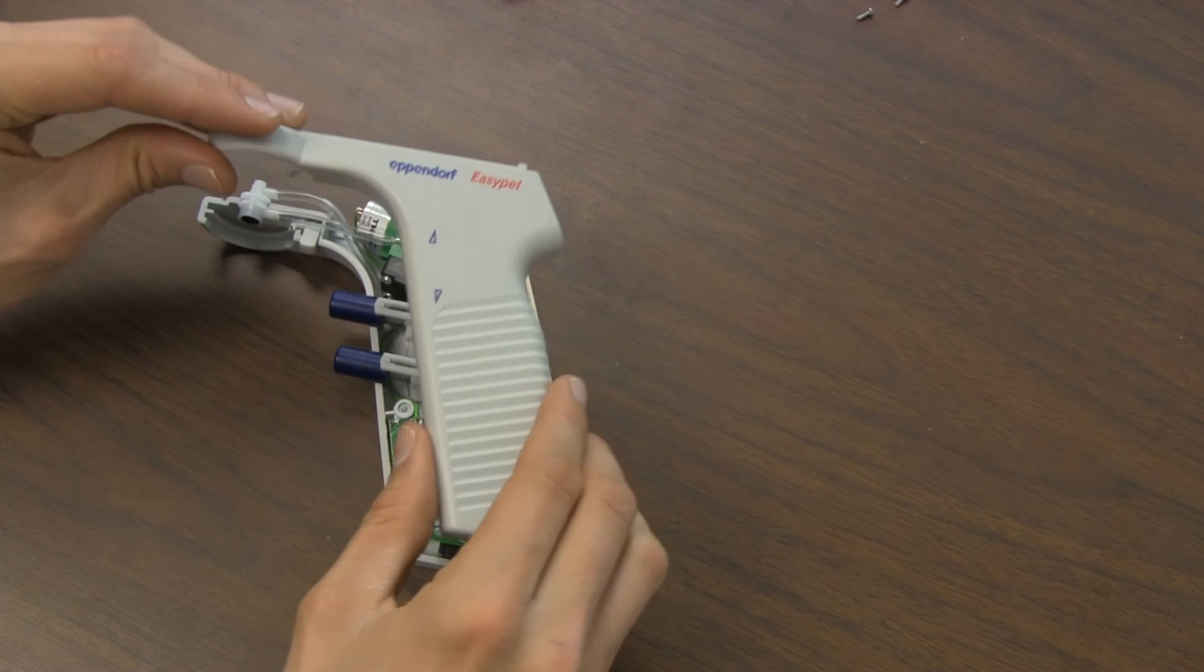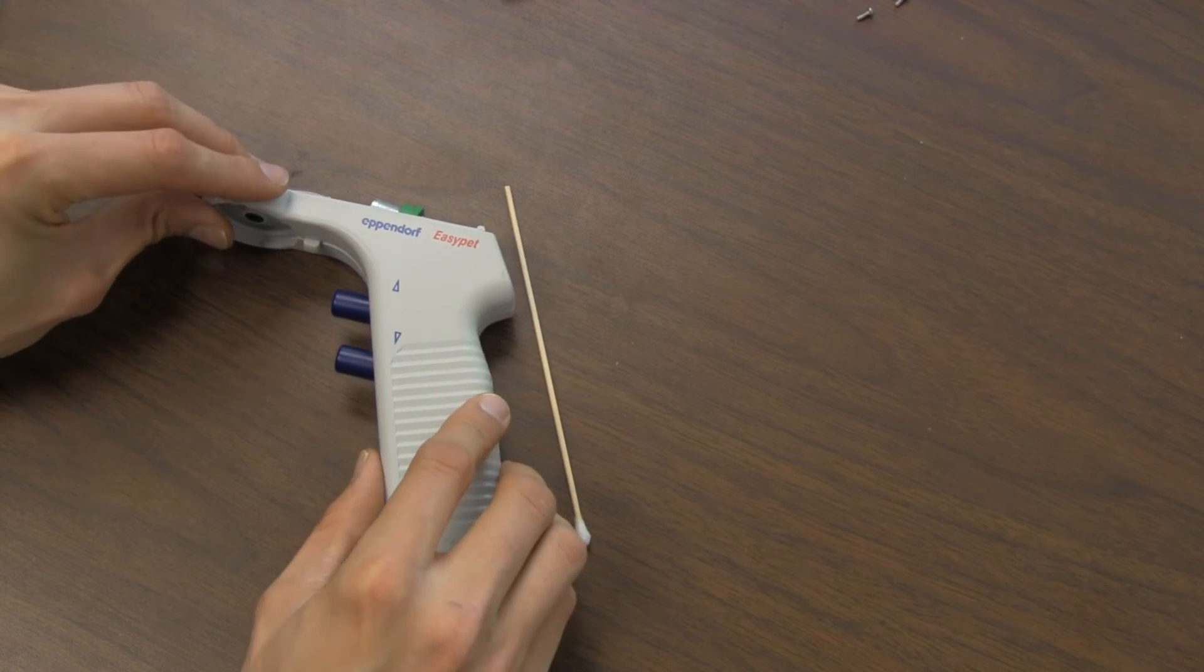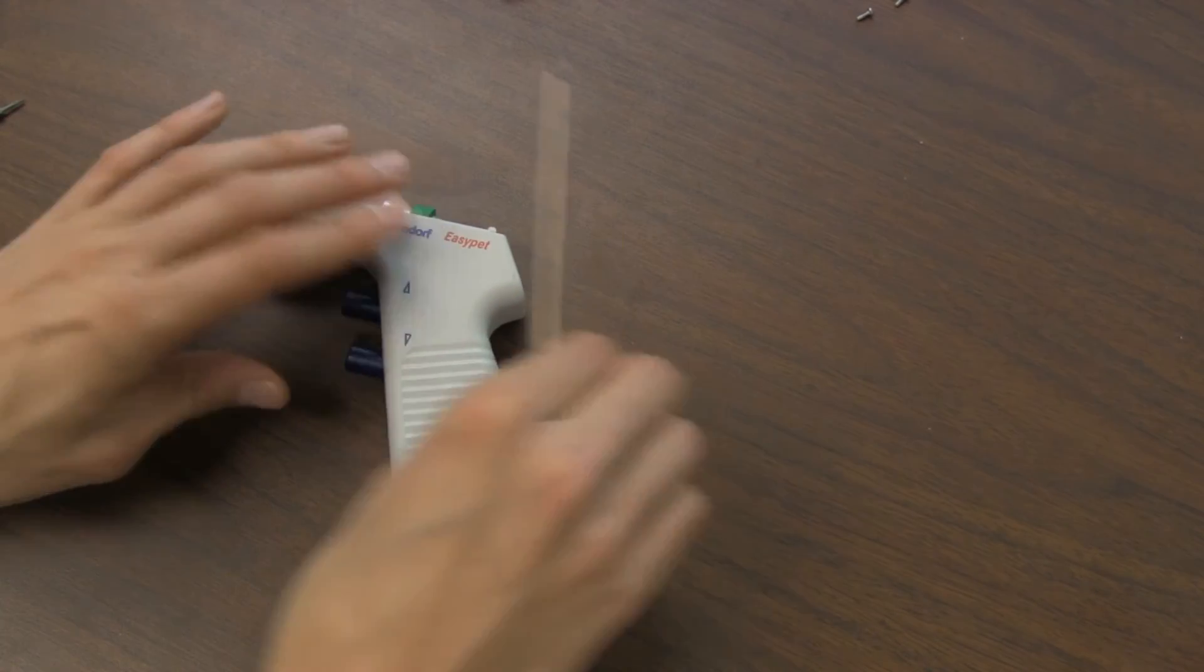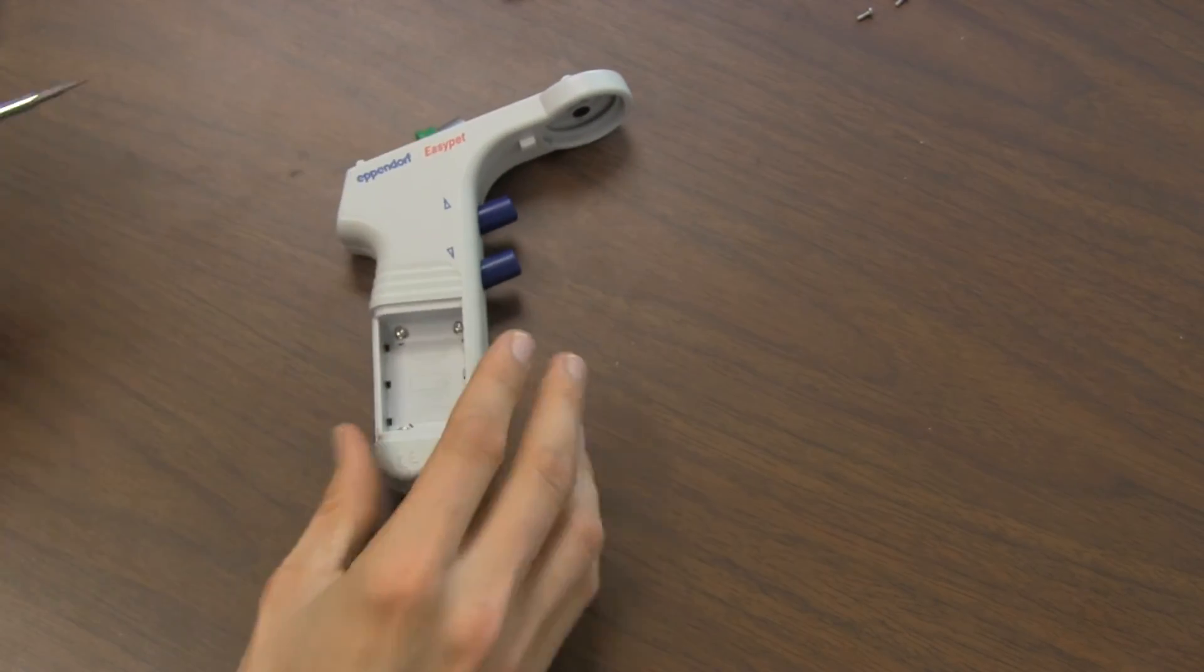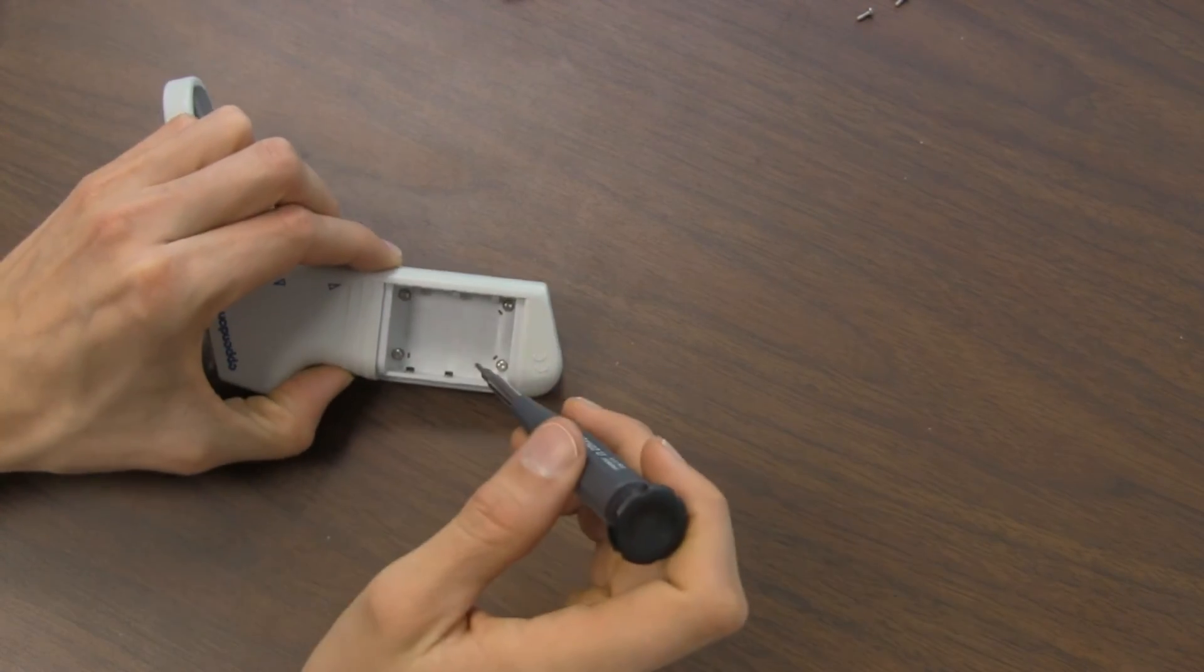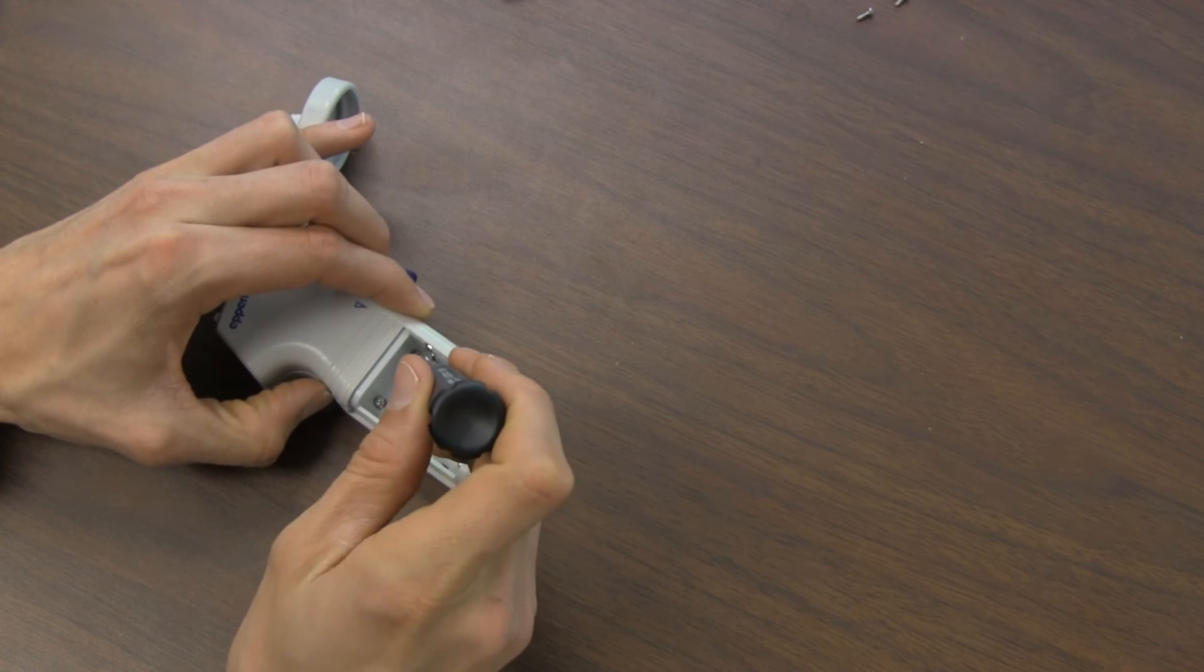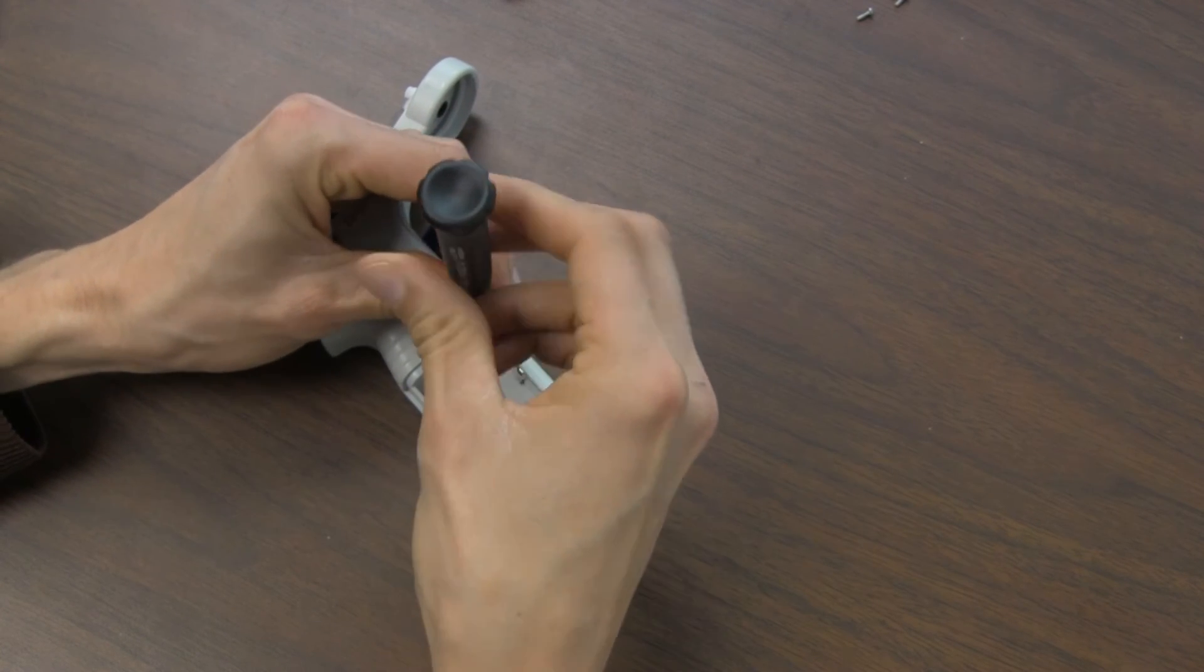Put the handle back on to reassemble. Flip it over. If these screws stayed in place, if your screws fall out, put the screws back in and screw the handle.